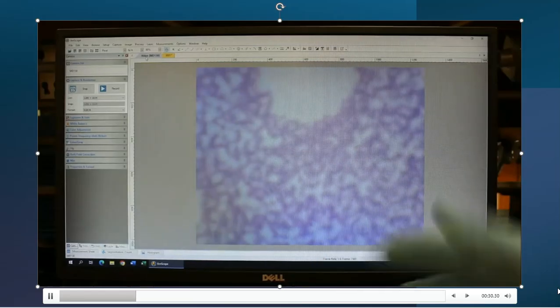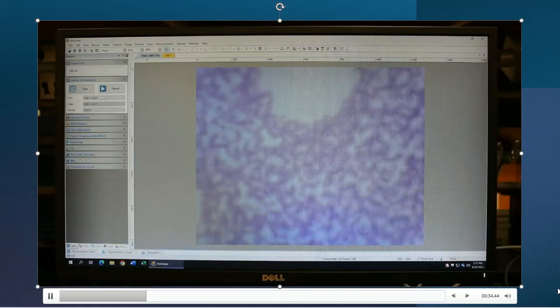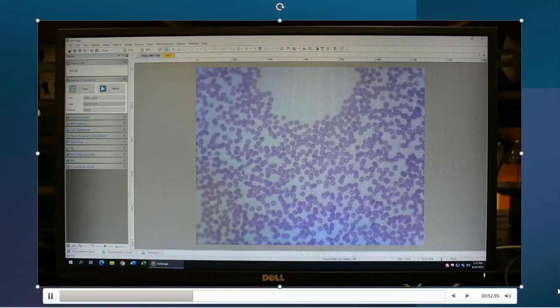It's not a big deal, it's expected, right? I've zoomed in a little bit closer, so of course it's not going to give me the same picture. But here's the magic. Most of the time when this goes on, I only have to work with the fine adjustment tool at this moment. So I'm going to go back over to the microscope and finely adjust it using that small little knob, and now my picture is back and it's nice, crisp, and clear. Maybe it doesn't show that way on the camera, but I promise you it is.